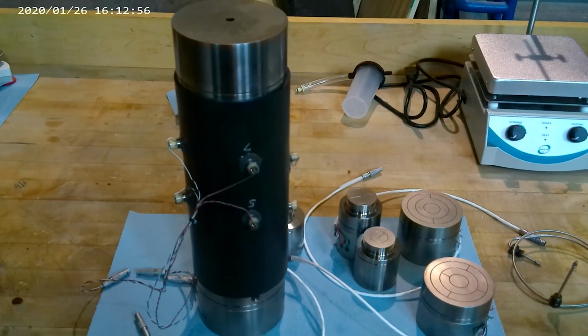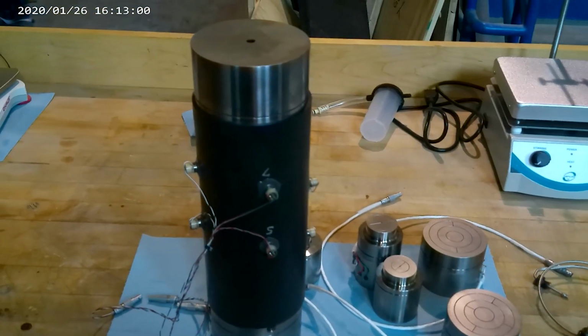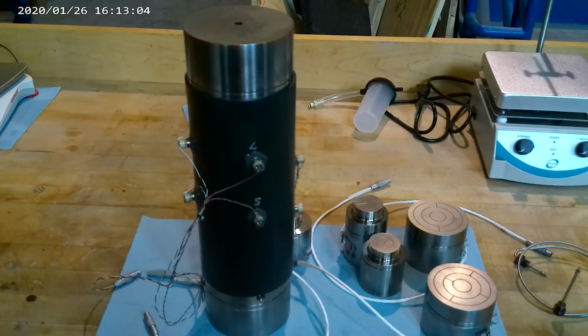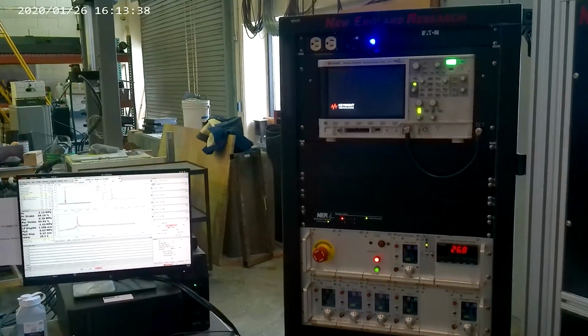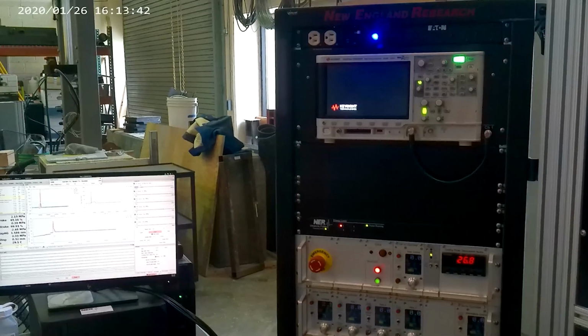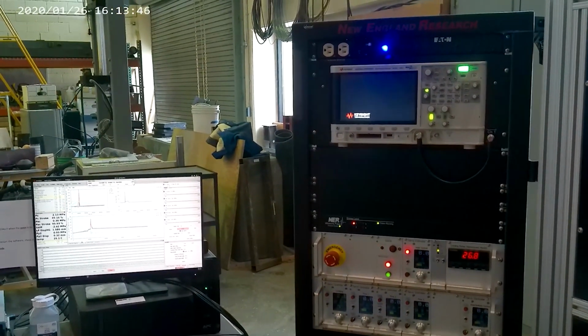This system provides simultaneous measurements of velocity, permeability, stress, and deformation over a user-prescribed loading path. This system is supported by an AutoLab software that controls the loading path and temperature profile during each test, stores the data, and processes the results at the conclusion of the experiment.